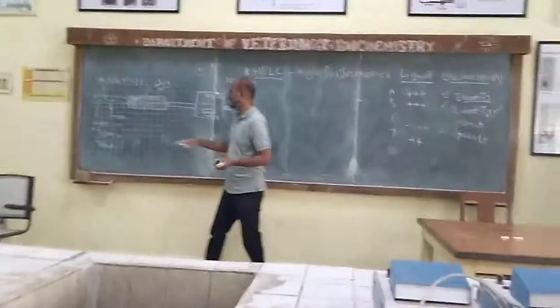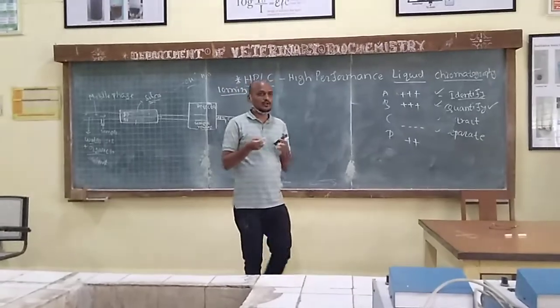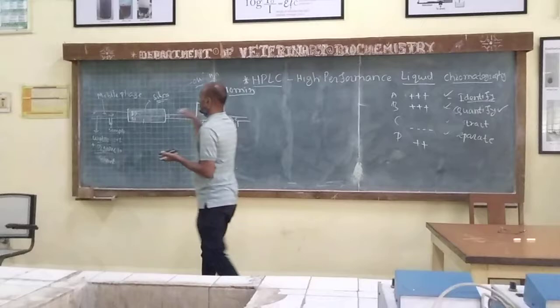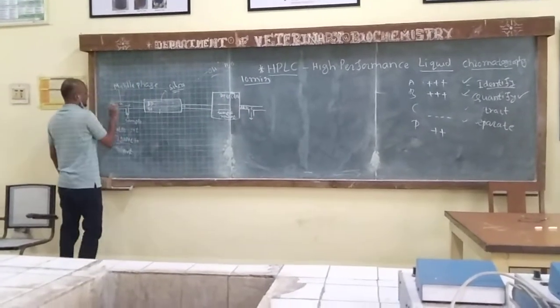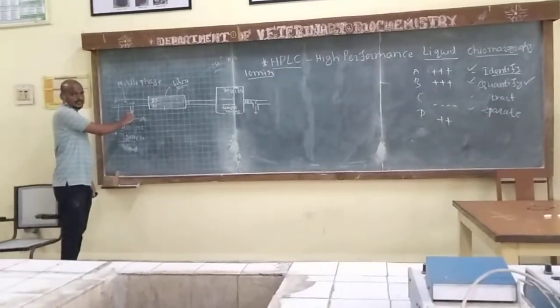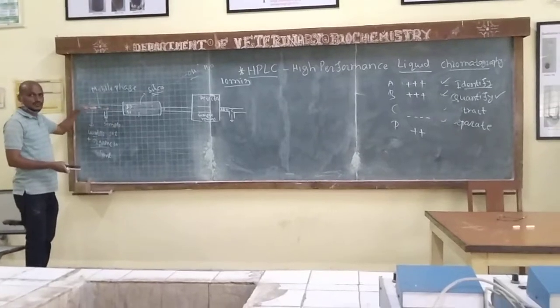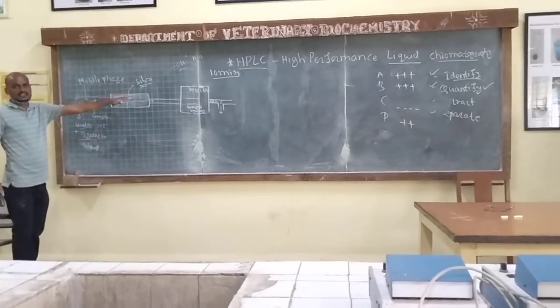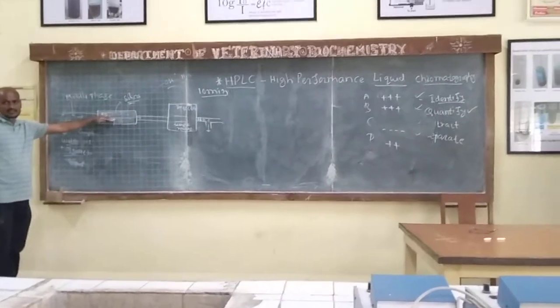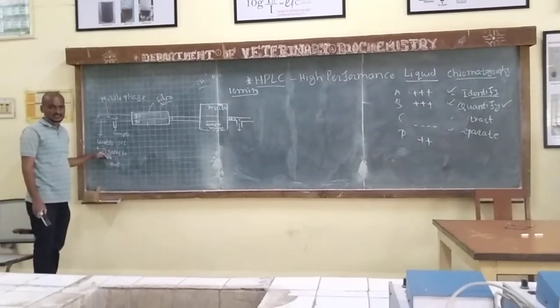Water being more means the mobile phase is more hydrophilic at this position. Initially we are passing through this. Before passing the sample, we will be doing equilibration, right? Equilibration means only the mobile phase is passed through the column, so the column gets wet and equilibrated. That is the equilibration step, with water at 90% and organic solvent at 10%.